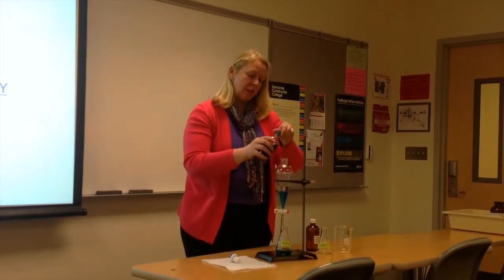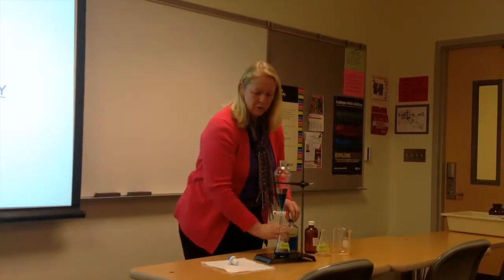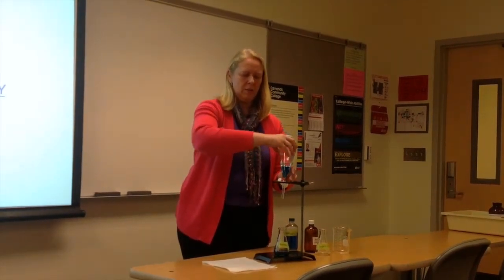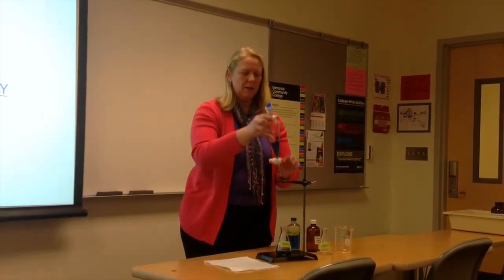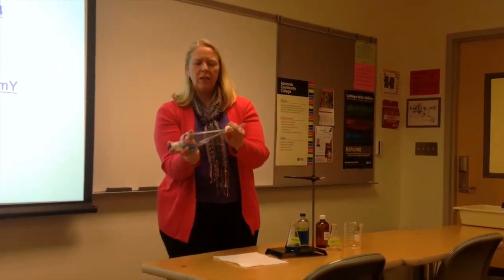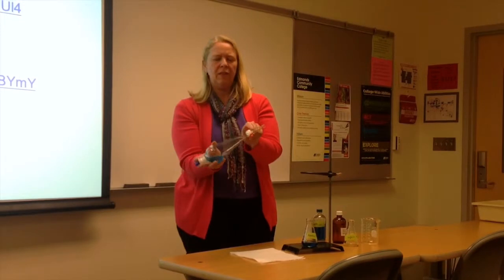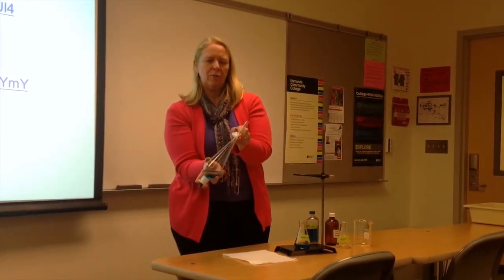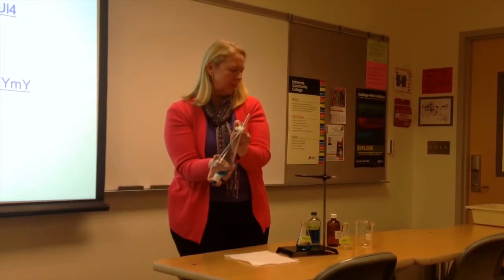So this would be our second extraction here, adding some more sodium hydroxide. And again, you want to just put the stopper on and vent, and sometimes these are tricky. One thing you want to avoid is shaking really heavily, because that could lead to emulsion. Now you just saw how much pressure I built up too.